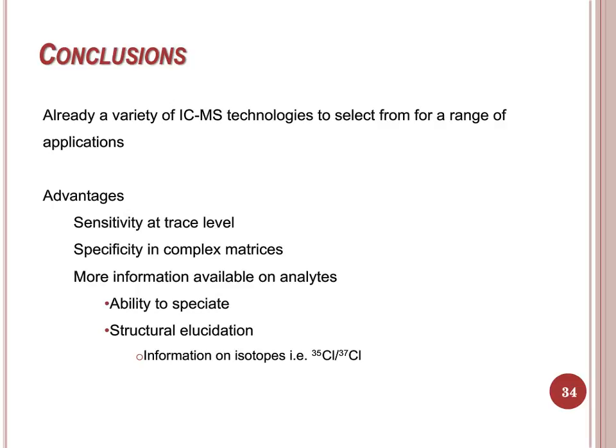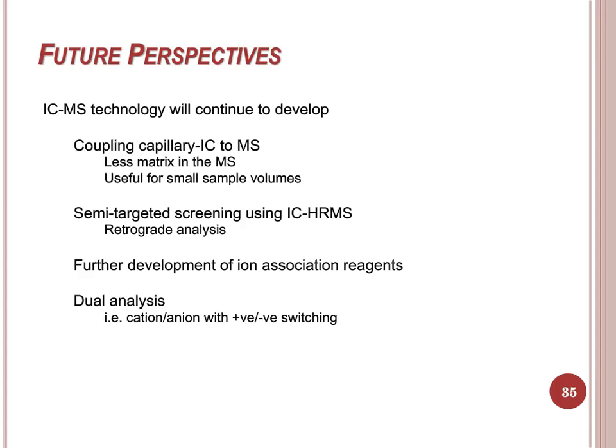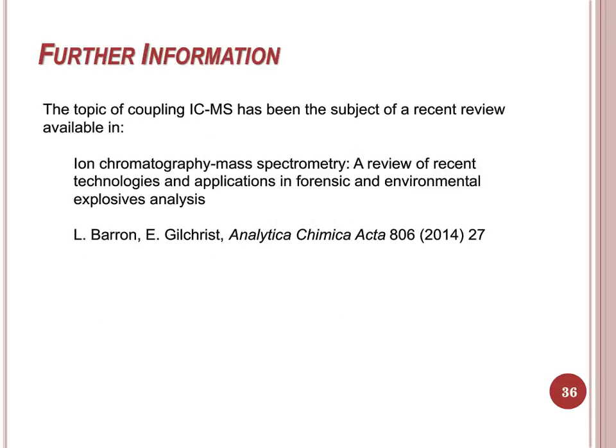With well-established ICMS methods out there, there is still opportunity to develop the use of ICMS further. Some potential areas are in improving the coupling of capillary IC to mass spec, using HRMS for semi-targeted screening, further development of ion association reagents, as well as dual analysis for more informative and efficient analysis. There is more information on this topic available in a review that was published last year for those that are interested.